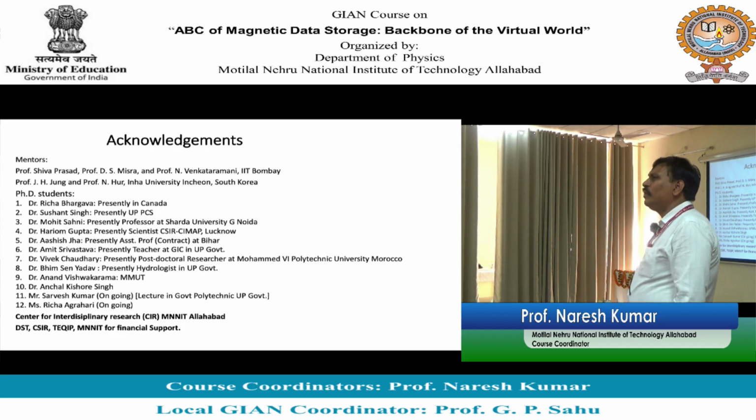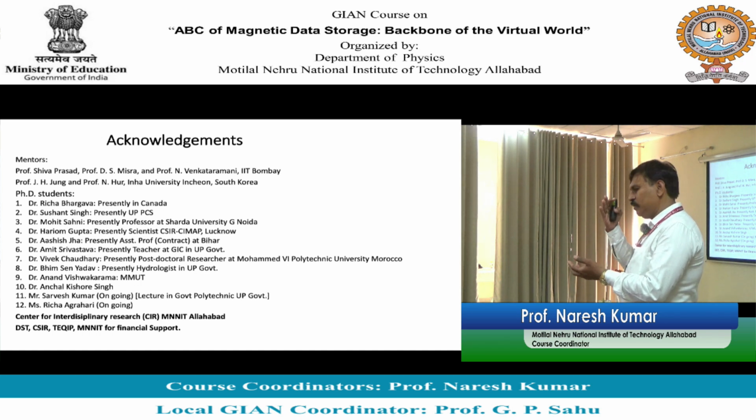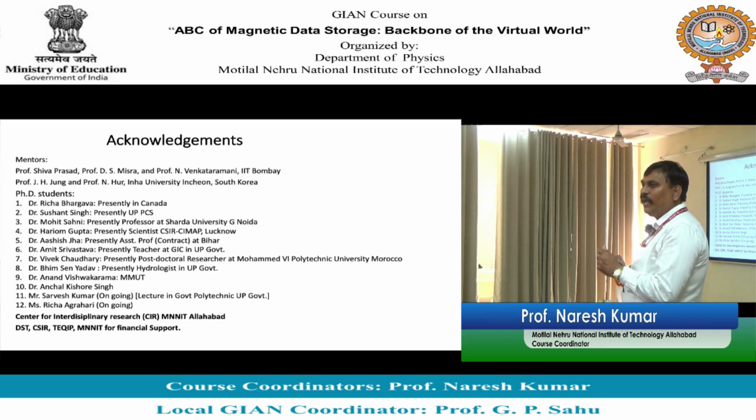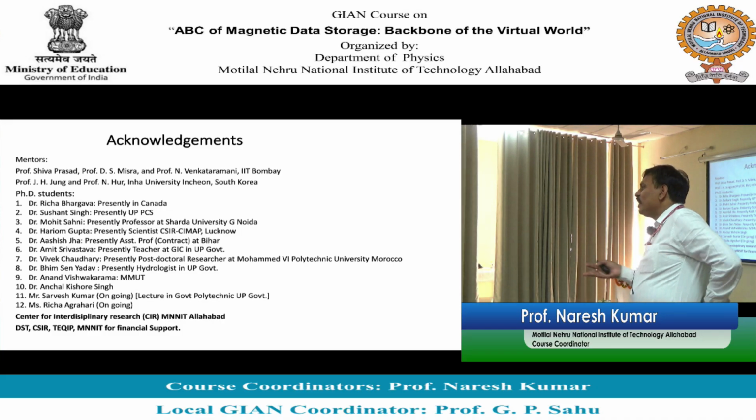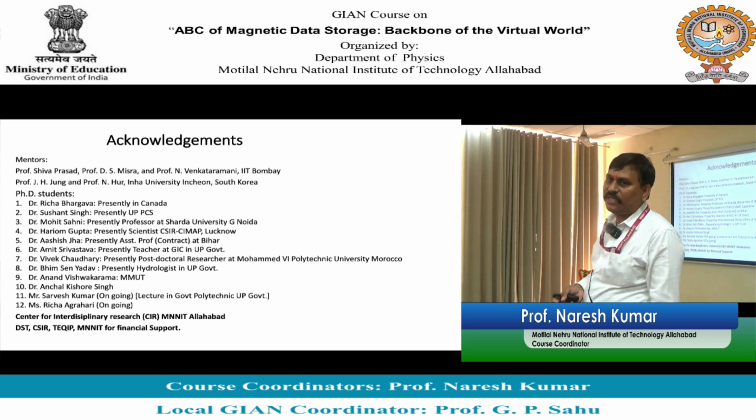So we have got a relatively good number of facilities. We have got XRD, we have got VSM, we have got FESEM, we have got UV-visible, PL, FTIR. FTIR is about to come. और क्या है? Ellipsometer और TGA, sputtering, PLD, thermal coating, particle size analyzer, 4 probe station. TEM नहीं है. TEM is very expensive. I am not getting it through. Recently we have got FESEM with EDX. So if anyone is interested, I would be happy to extend that facility.